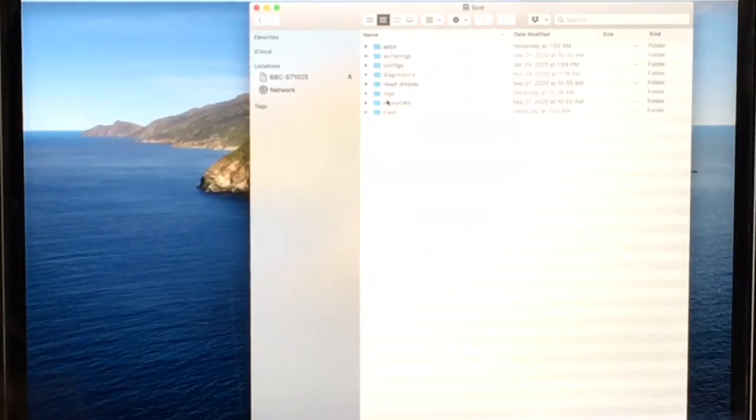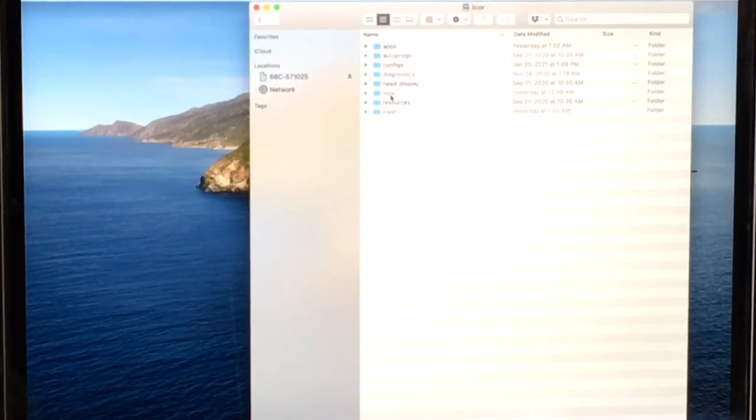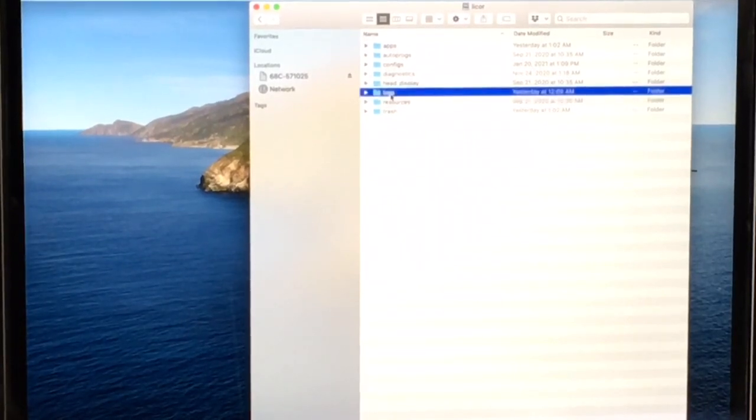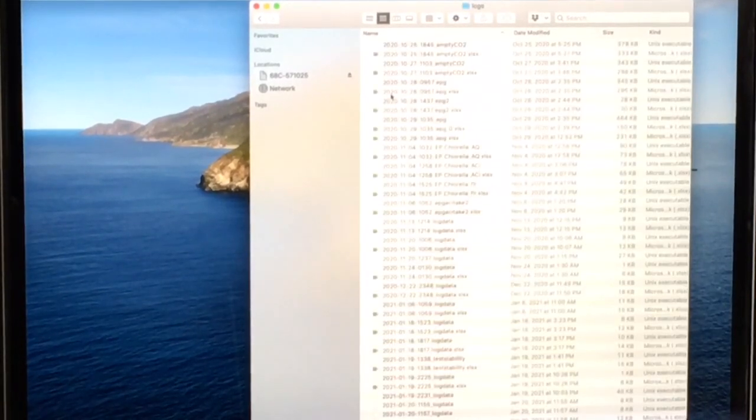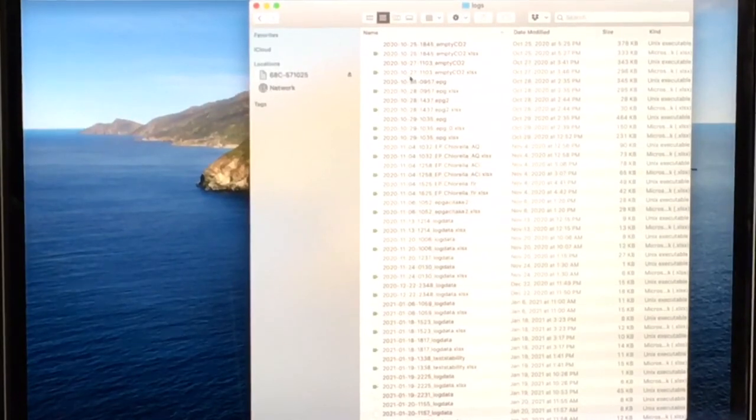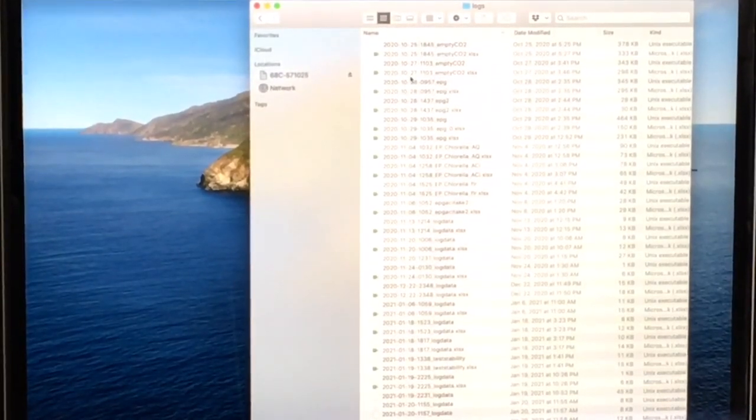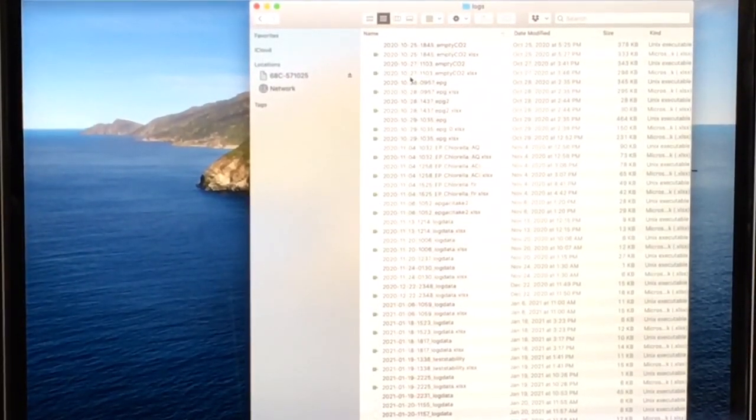And the same, your files should be in the logs folder. Double-click logs. And then, you can just copy and paste the file you would like to transfer to your computer.